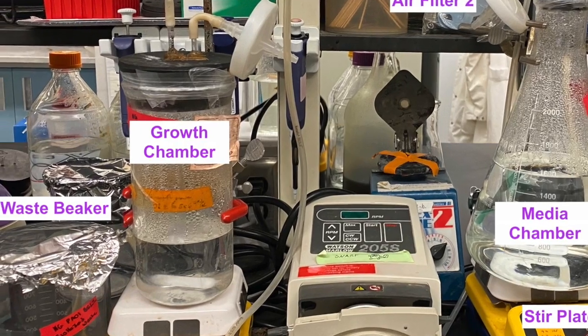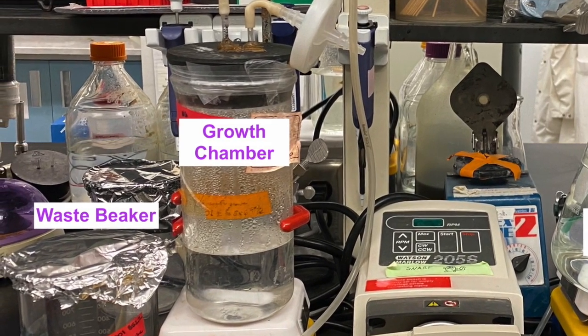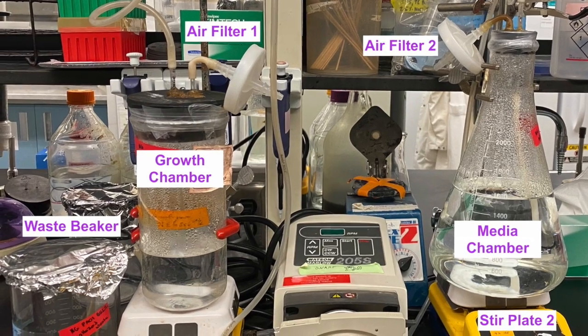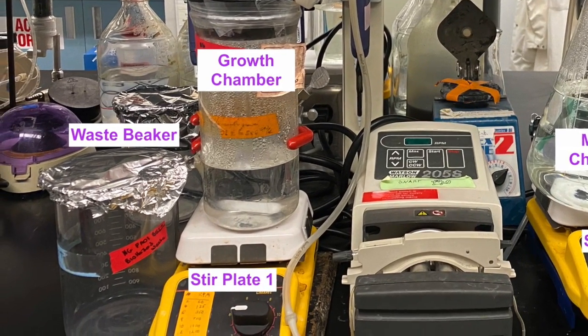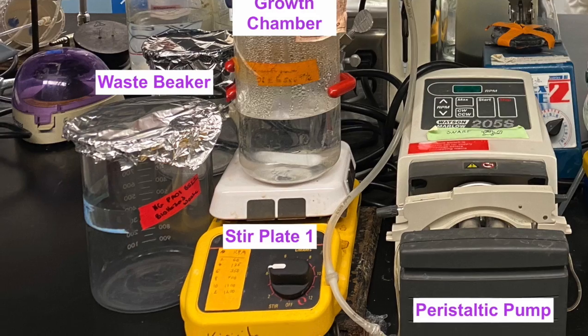This specific chemostat is culturing Pseudomonas aeruginosa. The growth chamber is connected to the waste beaker, where nutrients and end of life products are exiting the chemostat constantly.